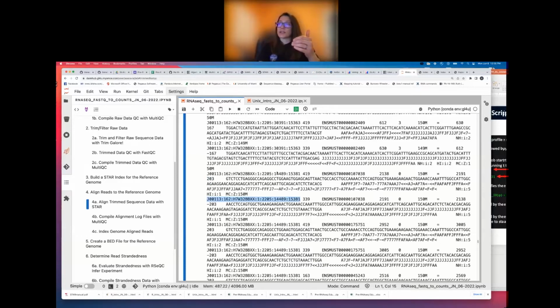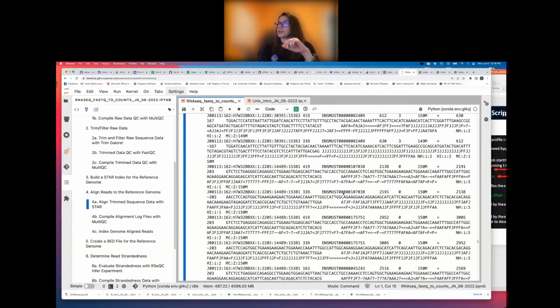location on the cluster, so the same address there. So we know that this is sequencing a sequence from that same template as the one above it, which makes sense because it has the same template length, but this is in the opposite direction as the one above it. So again, these 2 here represent a mate pair, and we see the transcript that it is aligning to.